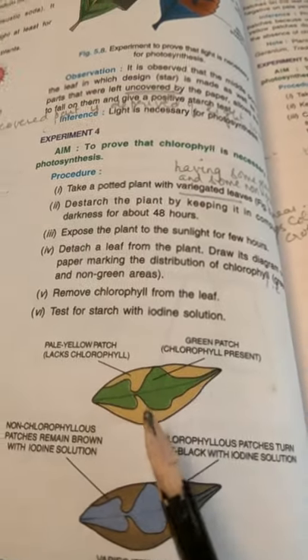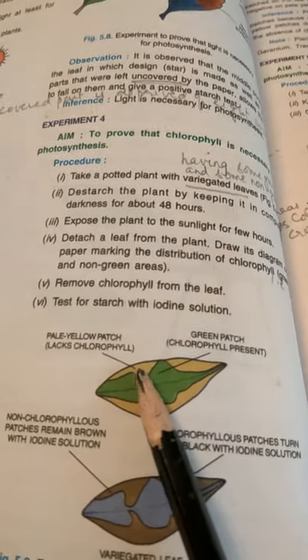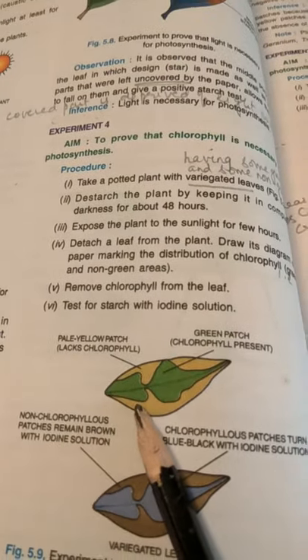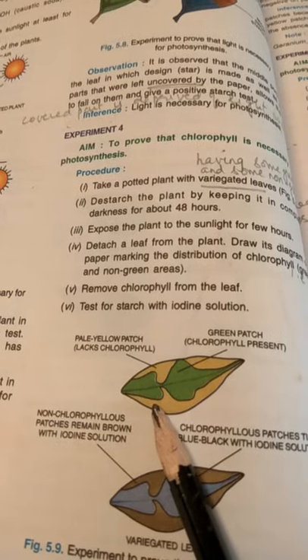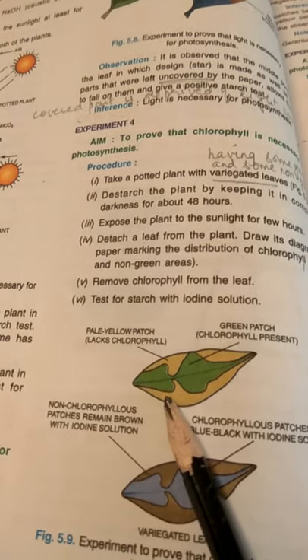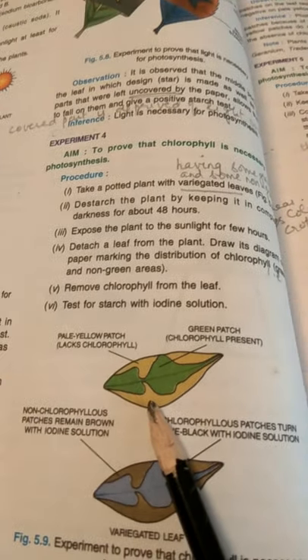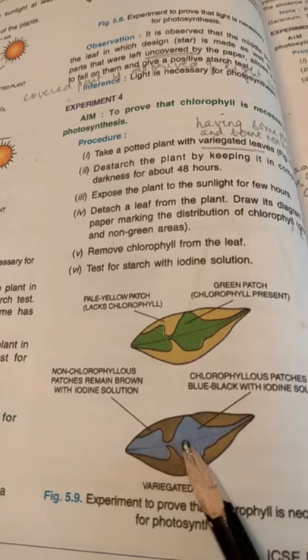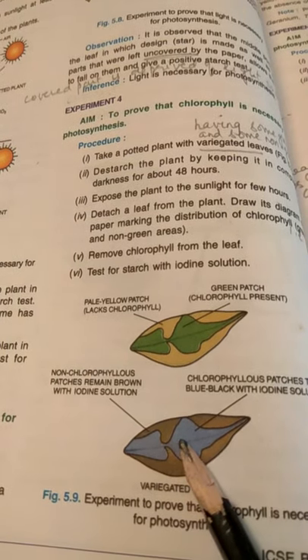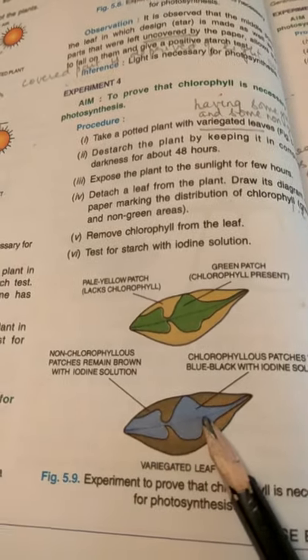We'll put a drop of iodine on the leaf. The part of the leaf which was non-green — where chlorophyll was not present — turns brown in color with iodine, proving that no starch formation has taken place, meaning no photosynthesis. The green part of the leaf turns blue in color with iodine, proving that photosynthesis has taken place in that area.